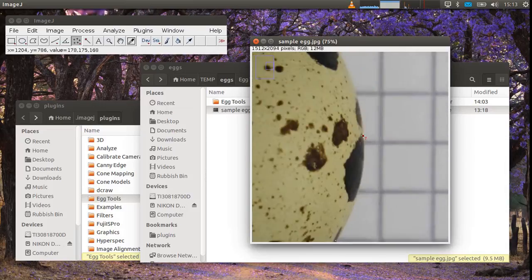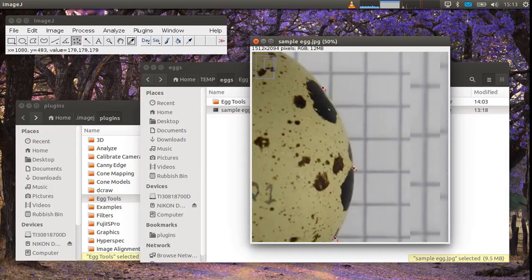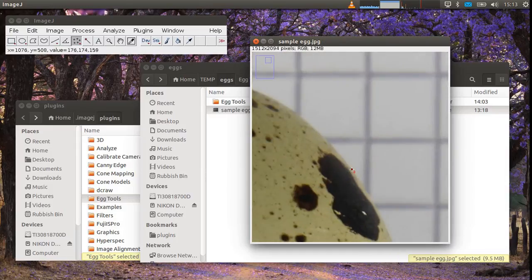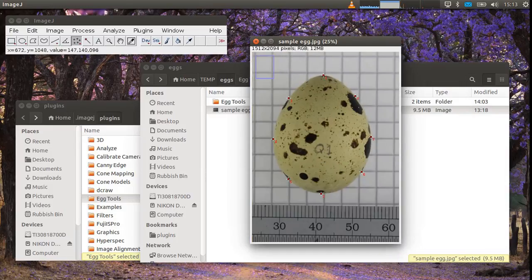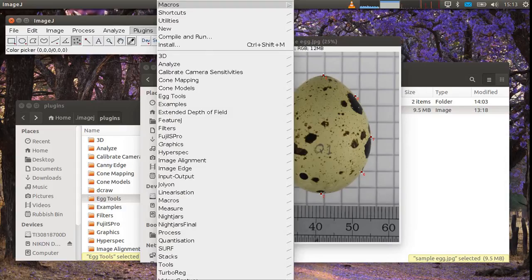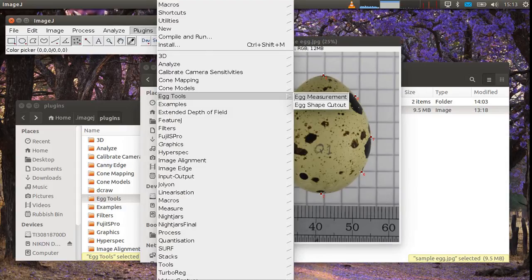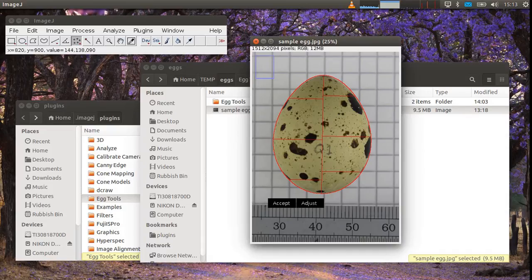It doesn't matter how many points around the edge of the egg that you use as long as it's eight or more. I find that that works very well. Now I'll go plugins, egg tools and egg measurement and you'll see it will draw a line around the egg.